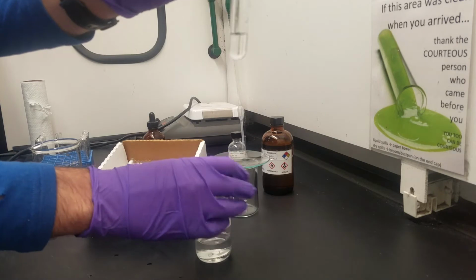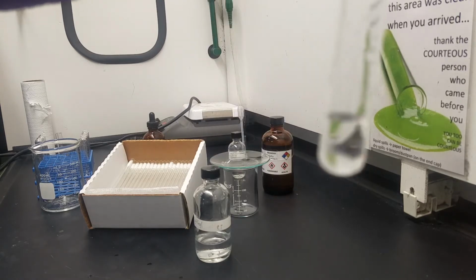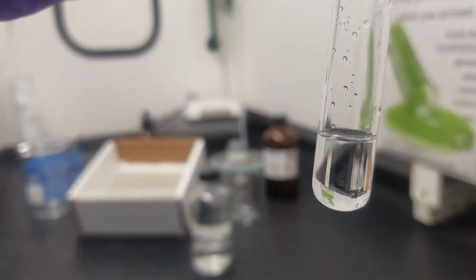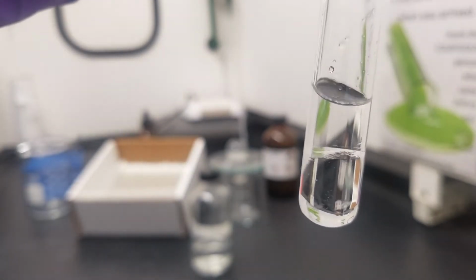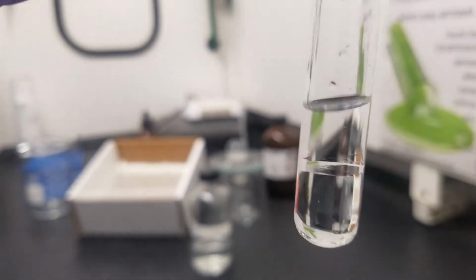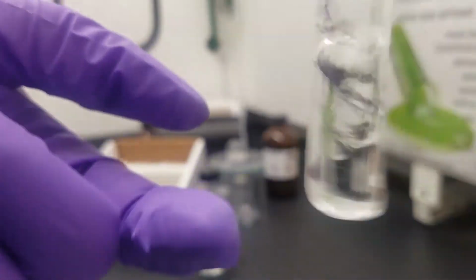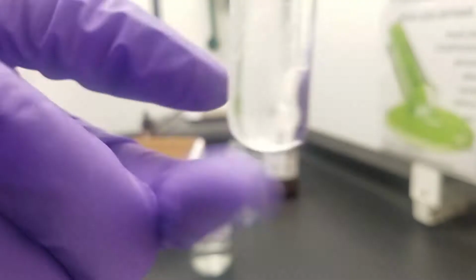Note the capping here, and then we'll see the zoom in here in just a second. And here again, we might see those two layers. We want to ensure they mix, just like we did with the ethanol. We can do a finger flick at the bottom, and that will help agitate those two layers to get them evenly mixed, if they will.